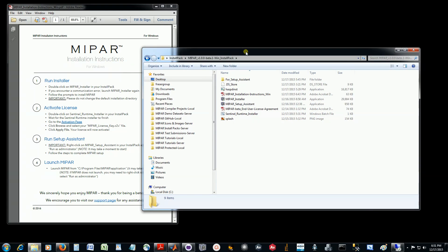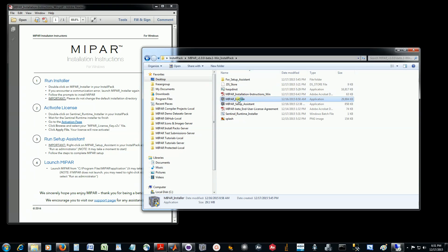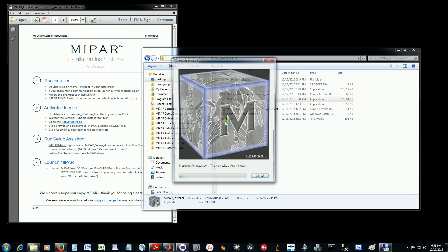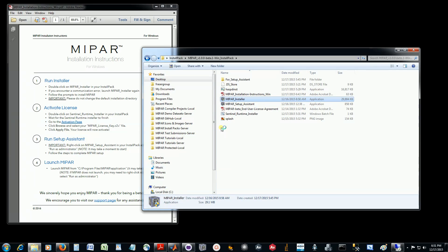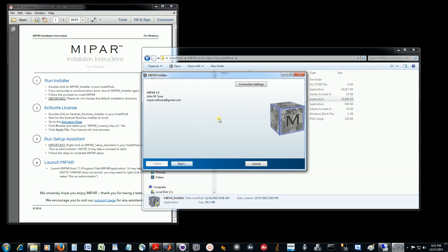We see the first step is to run the installer. So we'll double-click on the MyPAR installer and let that start up. We'll click next.